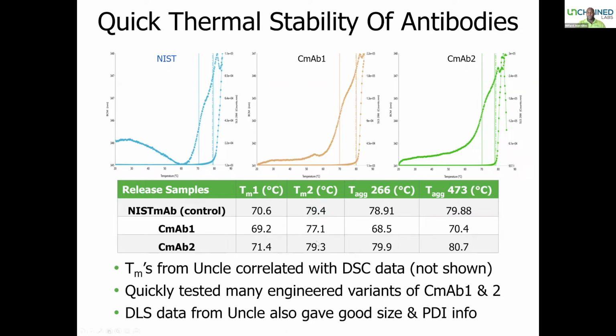And finally, you can see again that the TM2 for the mAb2 corresponds to the aggregation there, giving you a direct indication of what transition or what portion of your antibody, right, of that structure is responsible for the stability of your sample. And so if you are screening different clones or different mutations, you can know exactly which modifications are responsible for your stability, and therefore you can make intelligent choices as you begin to design or engineer your antibodies in early stages.